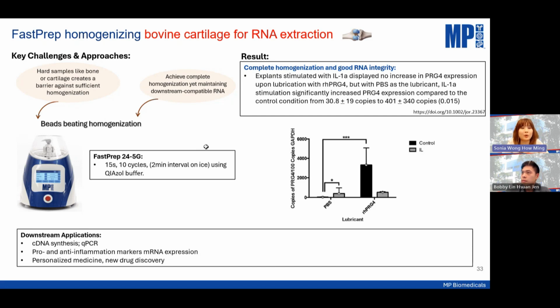Yes, Bobby. Pig bristle is a very interesting sample. Yes, of course, there's a concern. I'm not sure whether this person is interested in RNA or DNA, but regardless, of course, we want to maximize the DNA or RNA or other macromolecules that you are looking for from the sample. We want to maintain its integrity as much as possible.